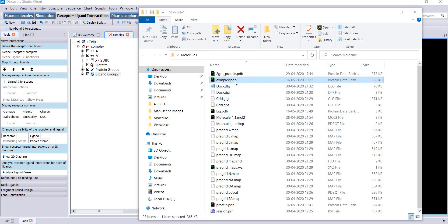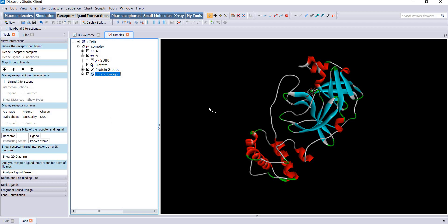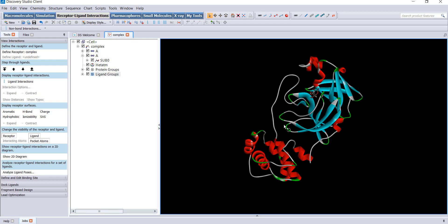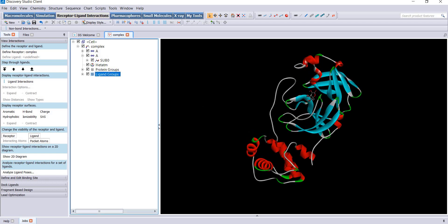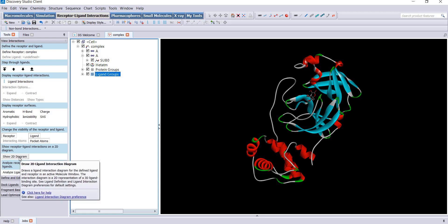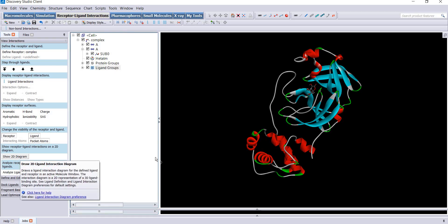First we will see molecular interactions using Discovery Studio. You should go to receptor-ligand interactions and then look for show 2D diagram. Just click it.